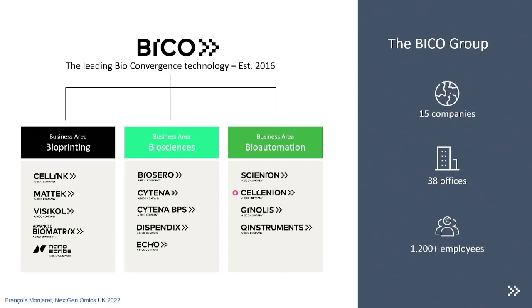The time cost and the manual time to process, let's say, 1,000 cells, yeah. How long will it take on your machine and how much money? So for transcriptomics, we have the product manager here. Sorry, for MS? For MS, so the kit is pretty cheap. Then the mass spec is pretty expensive. But you need to complain to Bruker or Thermo then. I'm sorry for the price. I'm just a scientist. Sorry.